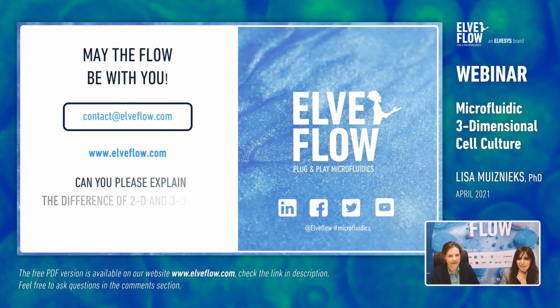Sorry. Definitely. Another question from Mitra Akbari. Hello, can you please explain the difference of 2D and 3D chips? All right, so there's not necessarily much difference between them. You can have, 2D chips often have just one channel, for example, because the liquid is free to move through the channel.